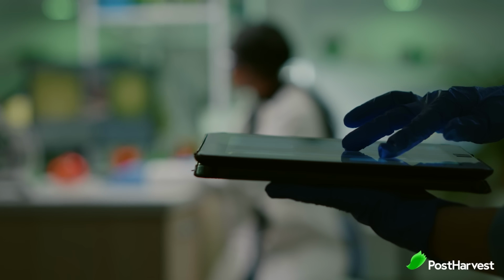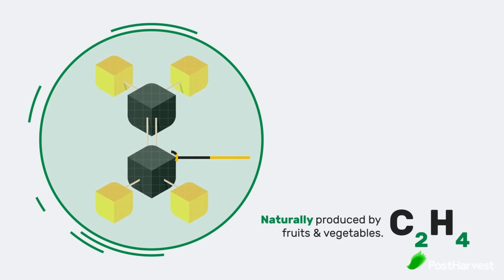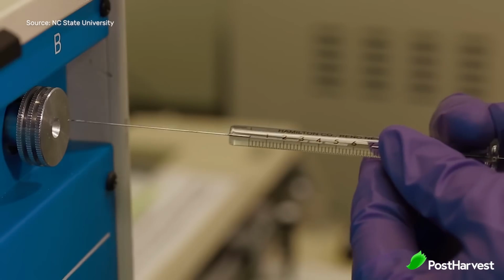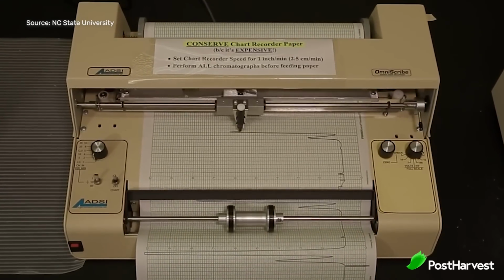One of its primary uses is to detect organic compounds, including ethylene. Ethylene is an organic compound released by produce when it begins to ripen, and it's currently the most accurate way to determine the health of fresh produce and when it will achieve optimal ripeness for consumption. A sample of the air from the environment the produce is being stored in is analysed according to the levels of ethylene it has in it.